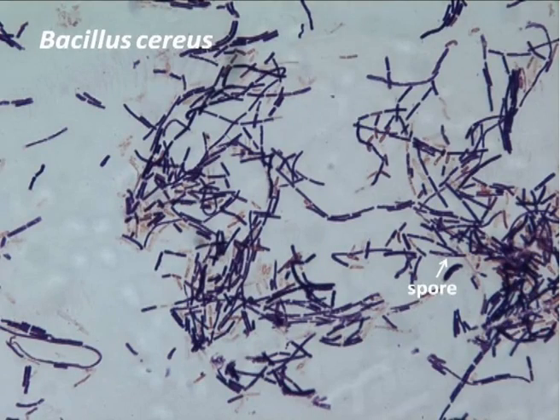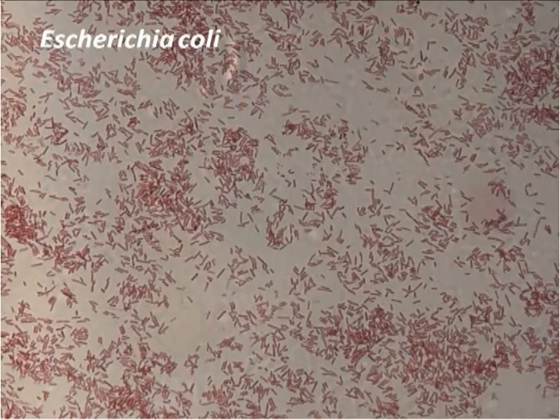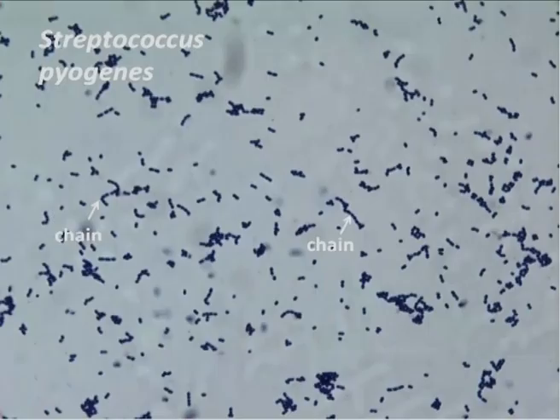Here we can see a Gram stain of Bacillus. Note the long positive rods and the spores that are present within the bacterial cells — the spores are the unstained areas. Only the vegetative part of the cell will take up the stain. Here we can see a slide of Neisseria, a Gram-negative diplococcus — an important medical bacterium. Now we can see a slide of E. coli; these are short Gram-negative rods. This is a slide of Staphylococcus aureus, showing grape-like clusters of Gram-positive cocci. Here we can see a slide of Streptococcus, a Gram-positive coccus — note the long chains of bacteria that are characteristic of this type.